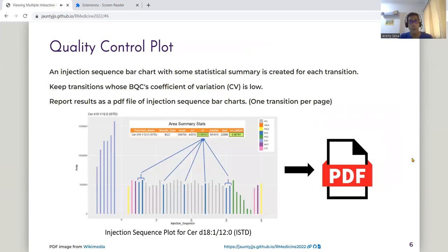We then plot this injection sequence bar chart using the area as the y-axis and the injection sequence as the x-axis. We then perform some statistical summary, and we want to keep transitions whose BQC coefficient of variation is low.